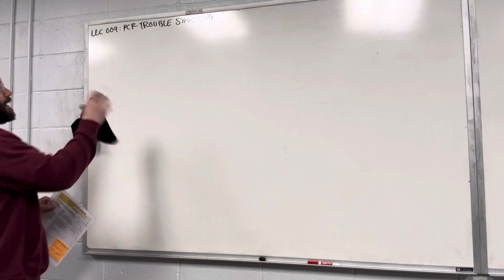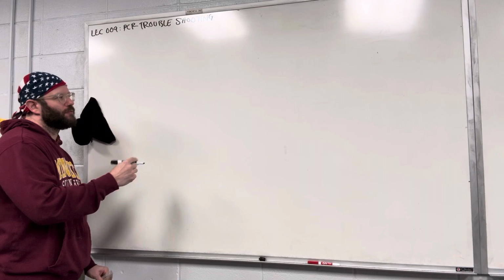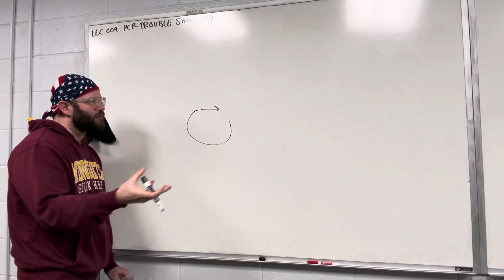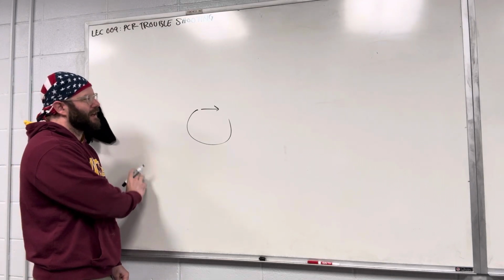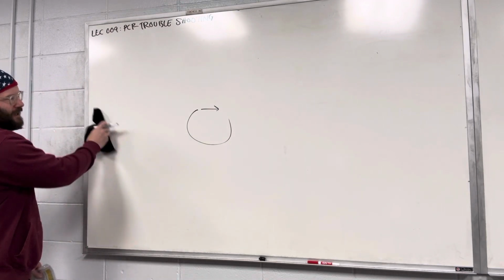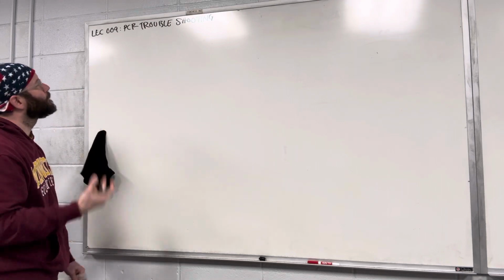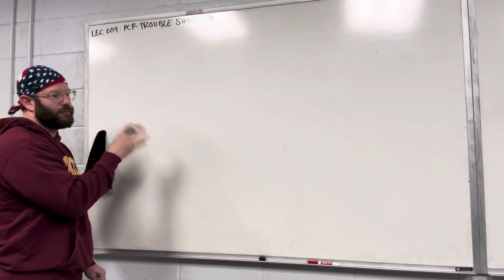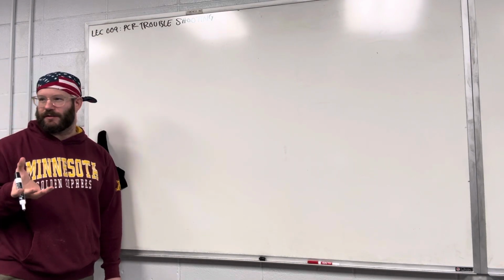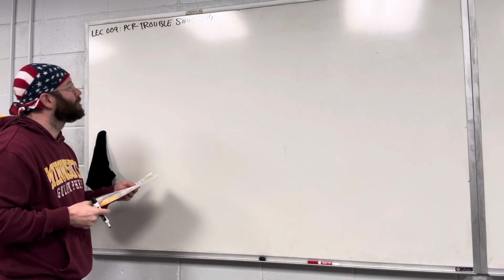Okay, today we're going to talk about PCR troubleshooting. Throughout this class I've been drawing plasmids and genes. In the next module, we will discuss how to actually get the gene and put it in the plasmid and how to make the modifications, etc. But much of that happens through PCR. So it's always worth talking about common things that go wrong in PCRs and how to optimize PCR, because it's a daily thing that you do pretty frequently as a researcher.